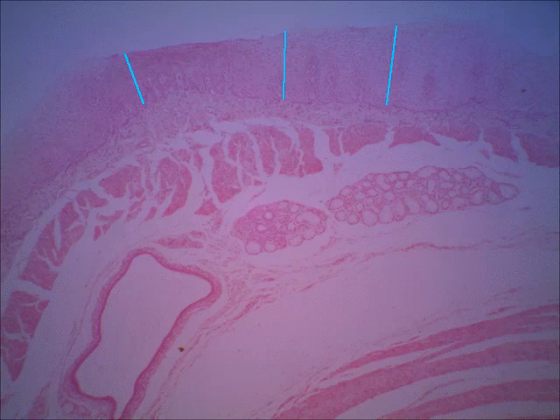And this looks quite a bit like a slide you may have seen from A&P1 when you were looking at the stratified squamous epithelium, because that's what the mucosa is made up of. It's very important that it's that tissue because it's a thick tissue, and that helps prevent things from absorbing through the wall of the esophagus. You won't see this in the lower parts when you get down to the stomach and the intestines, because those are absorbing organs, so you wouldn't want a lot of layers of cells covering that inner surface. Okay, so that would be the mucosa that you see in blue.